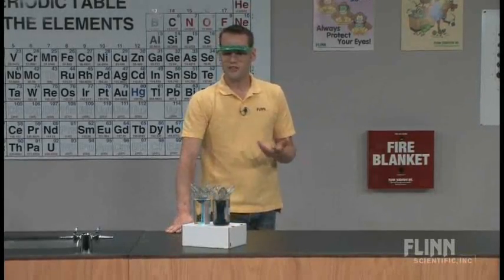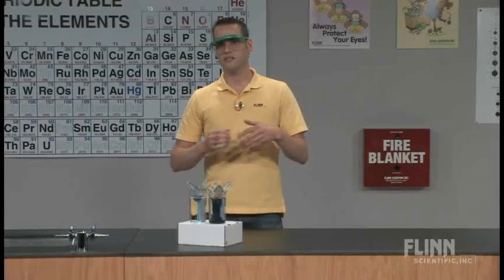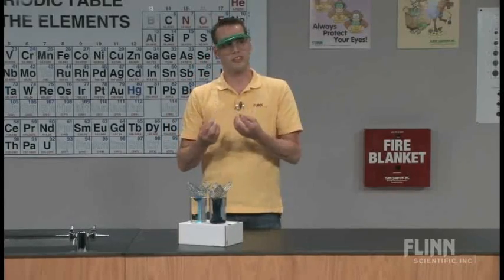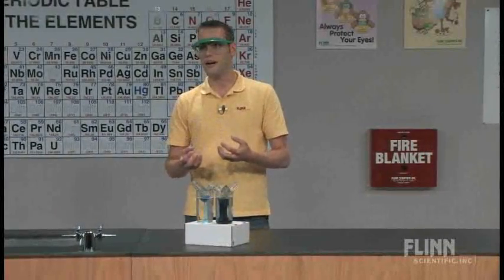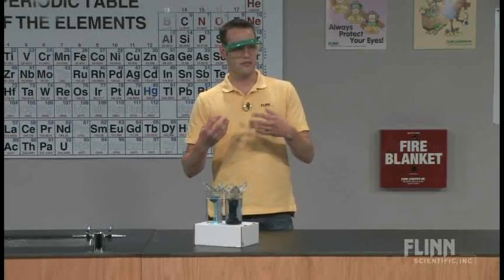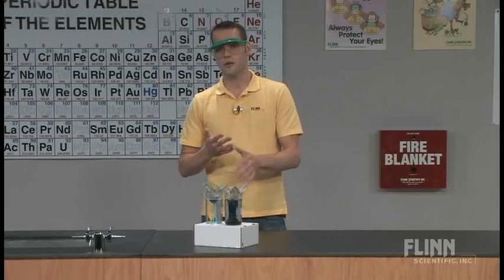I've also given this demonstration to our middle school teacher — my school has a middle school and a high school in the same building. My middle school teacher covers cave formation, rock cycles, geology, and plate tectonics, and I gave this to her so she could demonstrate stalactite formation. What happens when stalactites are forming is mineral deposits are literally dripping through the ceiling of a cave — or through the screen, if you imagine the screen as the ceiling of our cave — and those mineral deposits as they drip off just start getting deposited. A geology or earth science teacher can never demonstrate stalactite formation in real time — it takes hundreds of years. But this is a nice way to get kids to visualize the process, and it's a great demonstration to share with other teachers in your building.